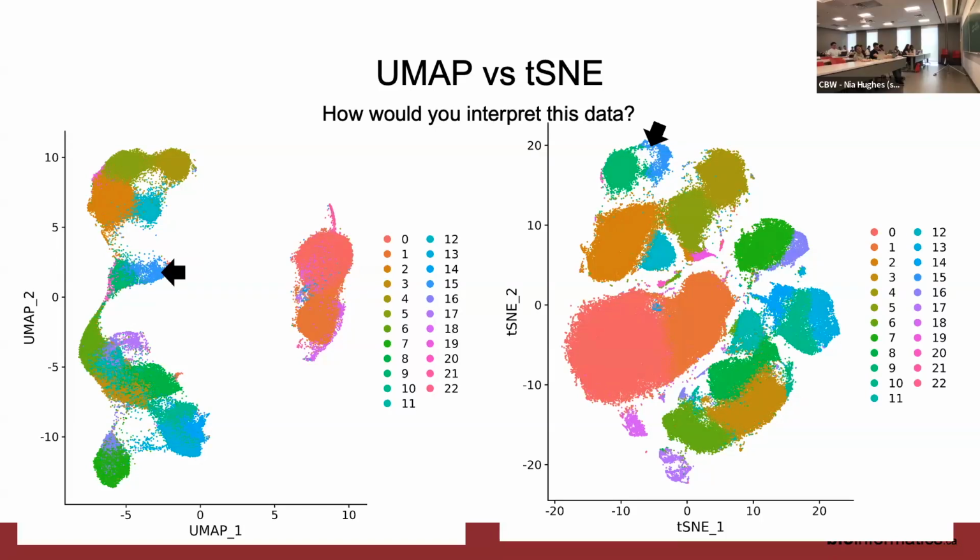Yeah? I have a quick question. For this kind of clustering, they are clustered based on the gene expression, right? So we already know that they are different somehow in the variation of the genes and the machine is just trying to cluster them differently. But it's just a matter of using different dimensional reduction that makes these two close or far from each other, right? But can we trust that they are already clustered in two different populations?